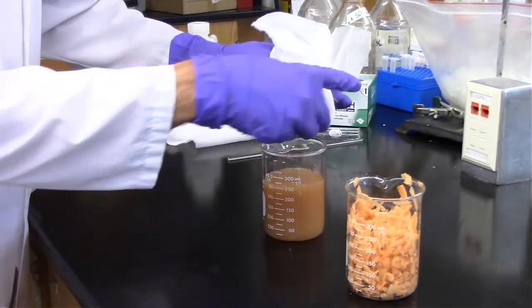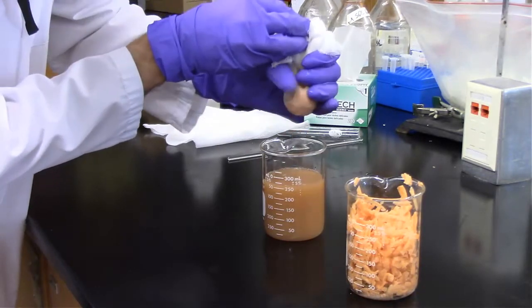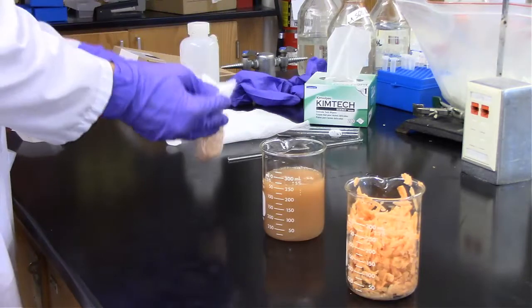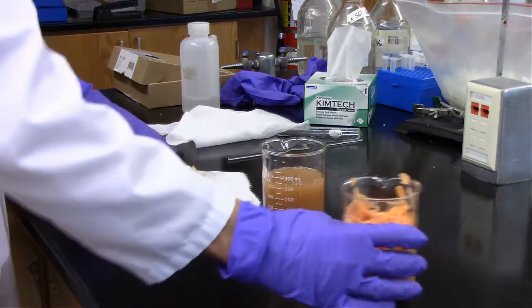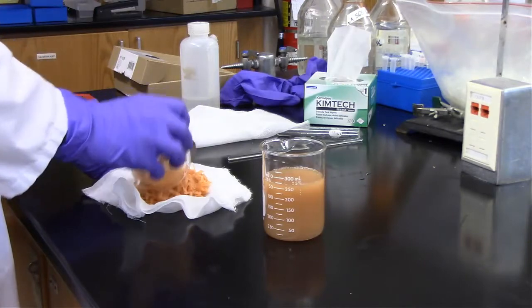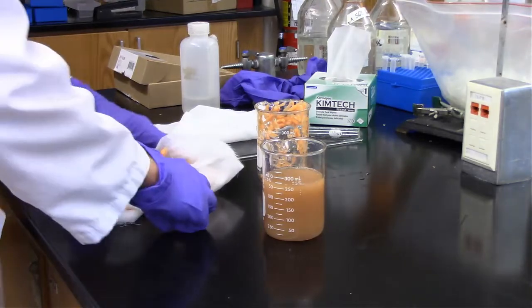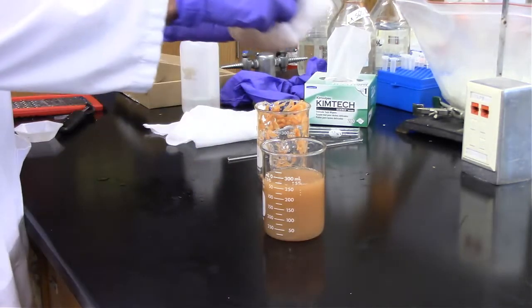We're filtering it through that cheesecloth again. We're going to squeeze a little bit out to maximize the amount of starch that comes through. And then we'll put the rest in the cheesecloth, or at least a little bit more, and squeeze that through. And again, looking back, I probably shouldn't have put that on the table. You can probably see some liquid leaking through there.